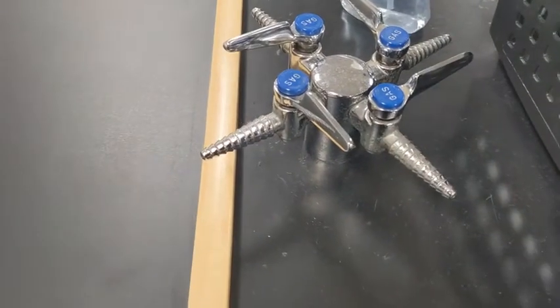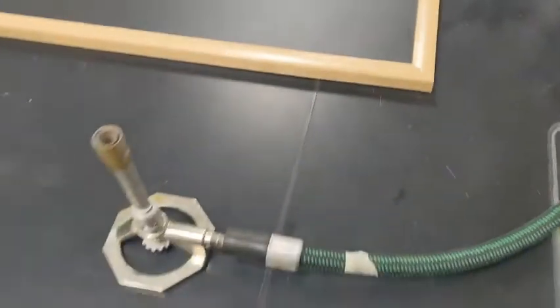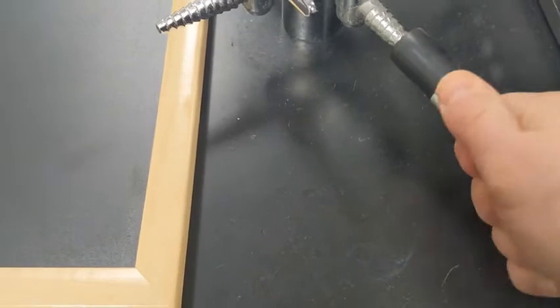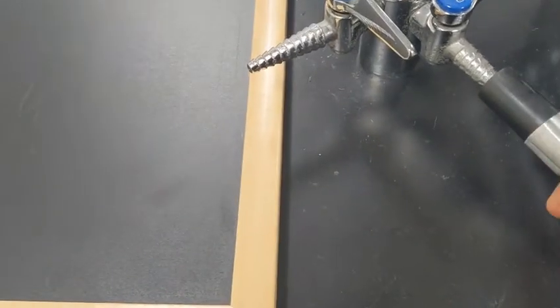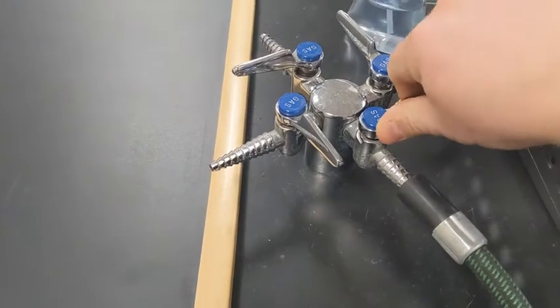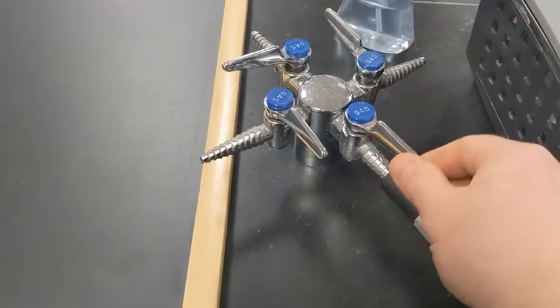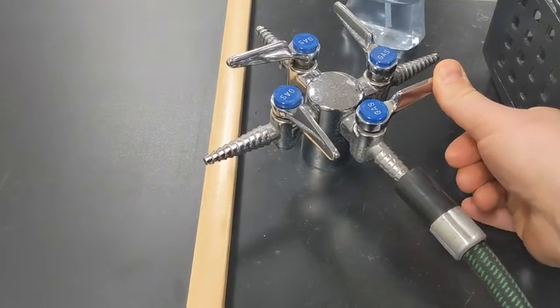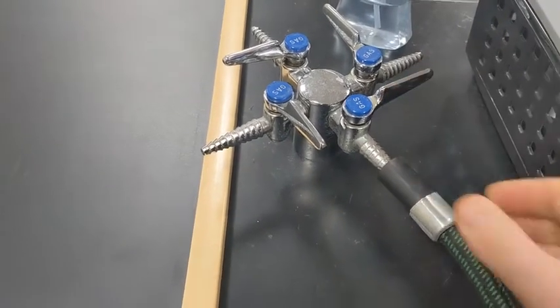The first thing we're going to do is take this tube and connect it right here — it doesn't have to go on any further than that. To turn it on, we do it that way, but we don't want to do that yet because we want to be ready to light it before we turn that on.